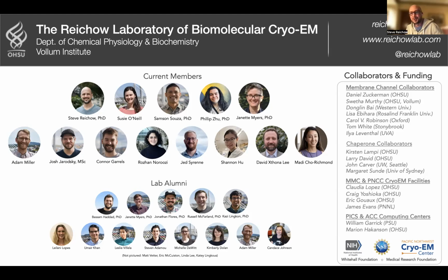Once one of them works sort of well, you kind of chase that one. So I can't say that we've exhaustively assayed the effectiveness of all the different MSPs. Once we found one that was working fairly well, we focused on optimizing the lipid to protein ratios, and that was a bit more cumbersome.